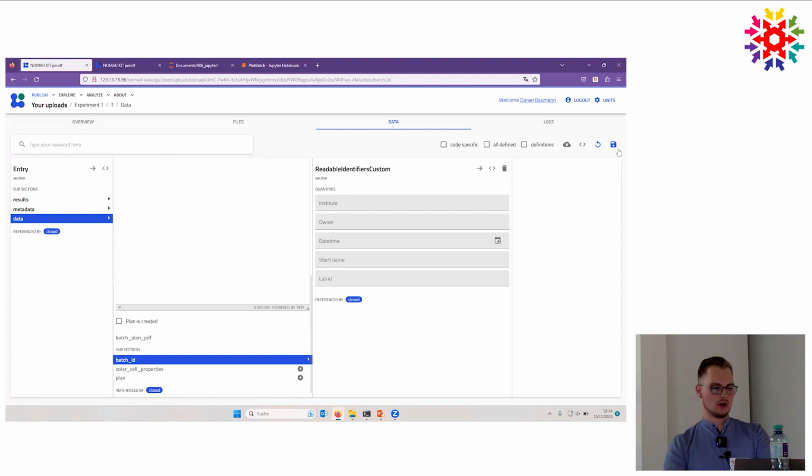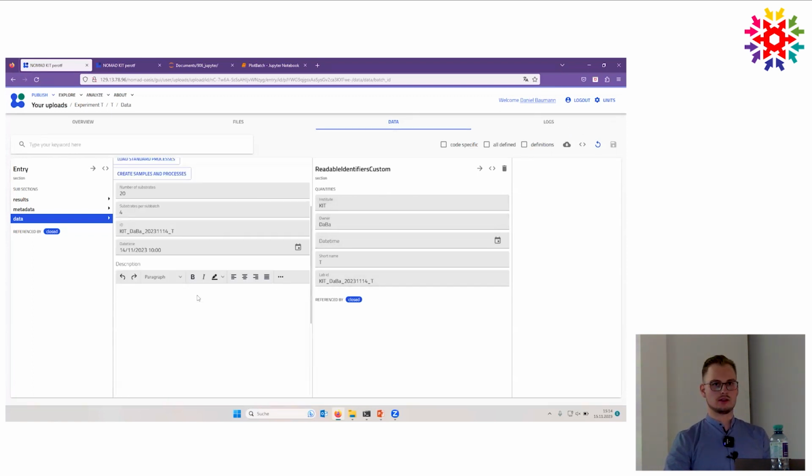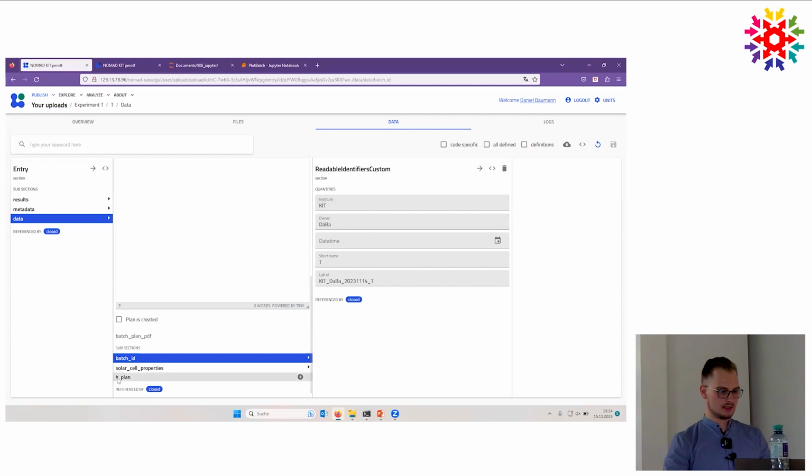And this is actually automatically generated from my account if I logged in. And here you can see the timestamp. OK. Next, we will go into the actual experiment.